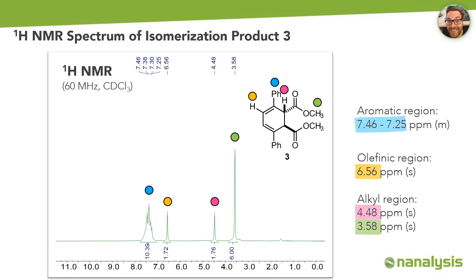The successful generation of the isomerization product can be confirmed by proton NMR as well. The aromatic hydrogen atoms appear as a multiplet in the range of 7.46 to 7.25 ppm due to the conjugated double bonds. The alkene signal shifts downfield to 6.56 ppm in comparison to the previous spectrum. Both the alkene and vinyl protons are observed as singlets rather than doublets, due to the absence of neighboring atoms. The methyl groups remain quite unchanged at 3.58 ppm.